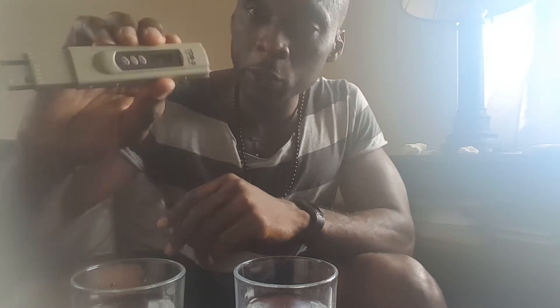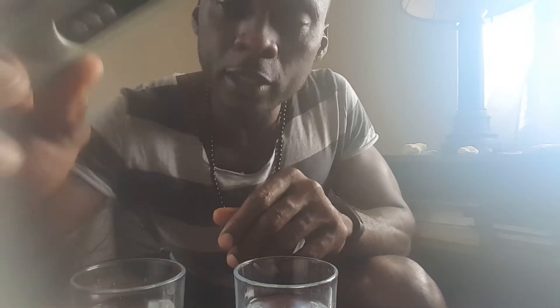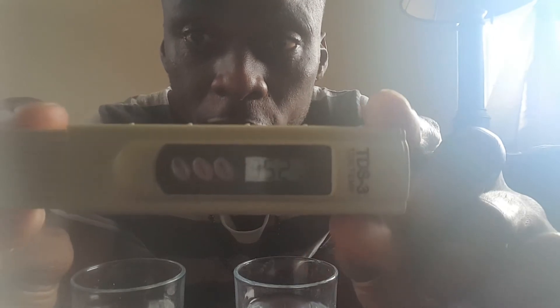So the rainwater is at 21 parts per million — I'll show you again, 21 parts per million. Now I'm gonna test the tap water. Bang on 353 — actually it's down to 352 now — 352 parts per million. You don't need to be a rocket scientist or a Harvard graduate to apply common sense and know that rainwater is the way to go.